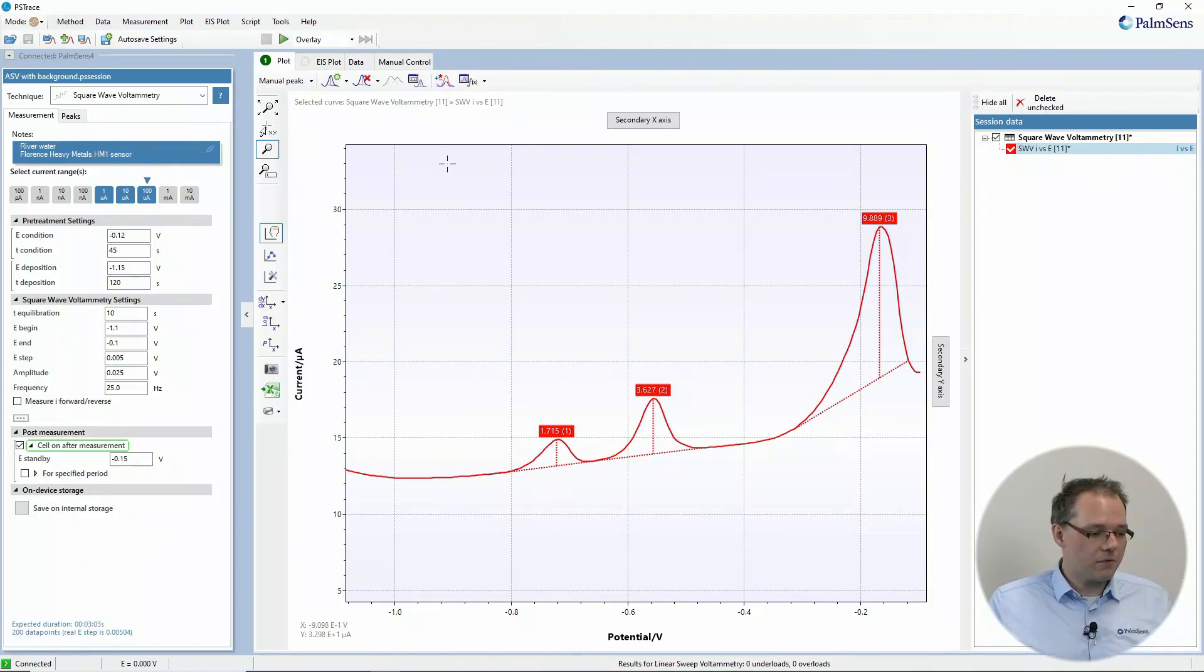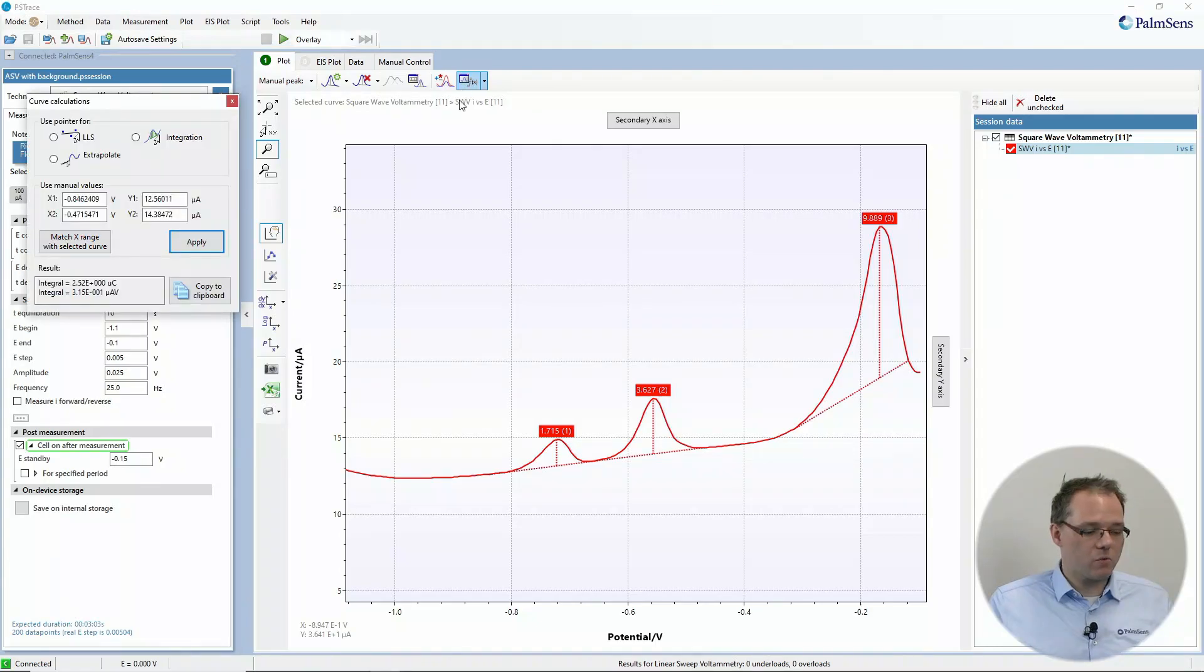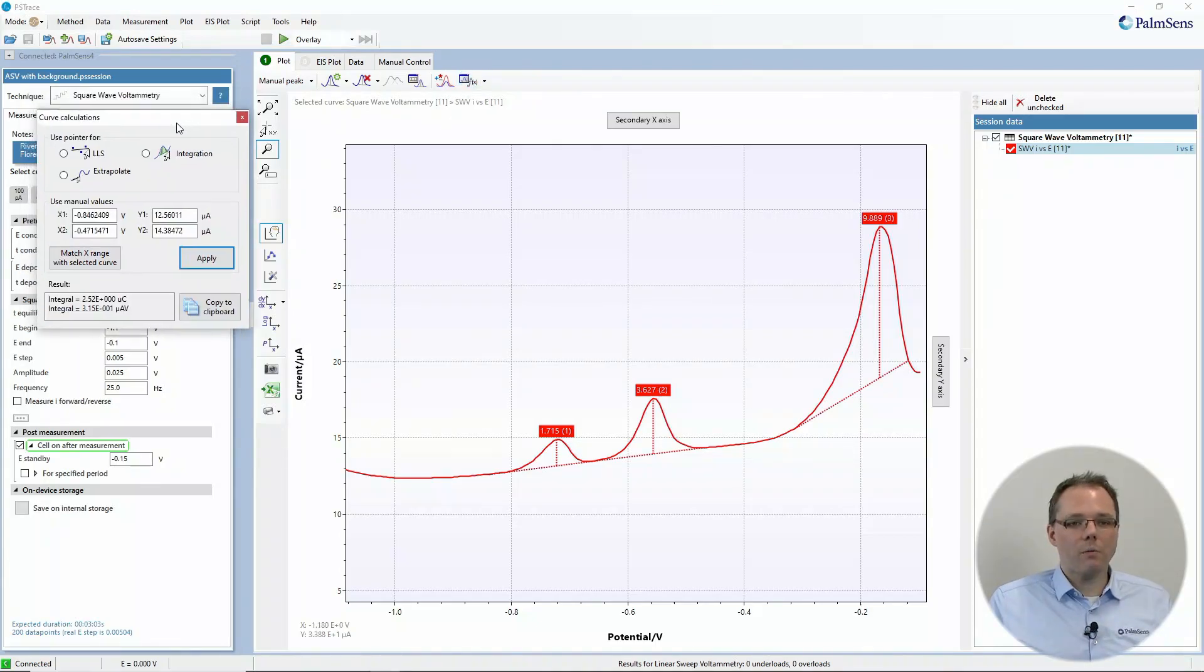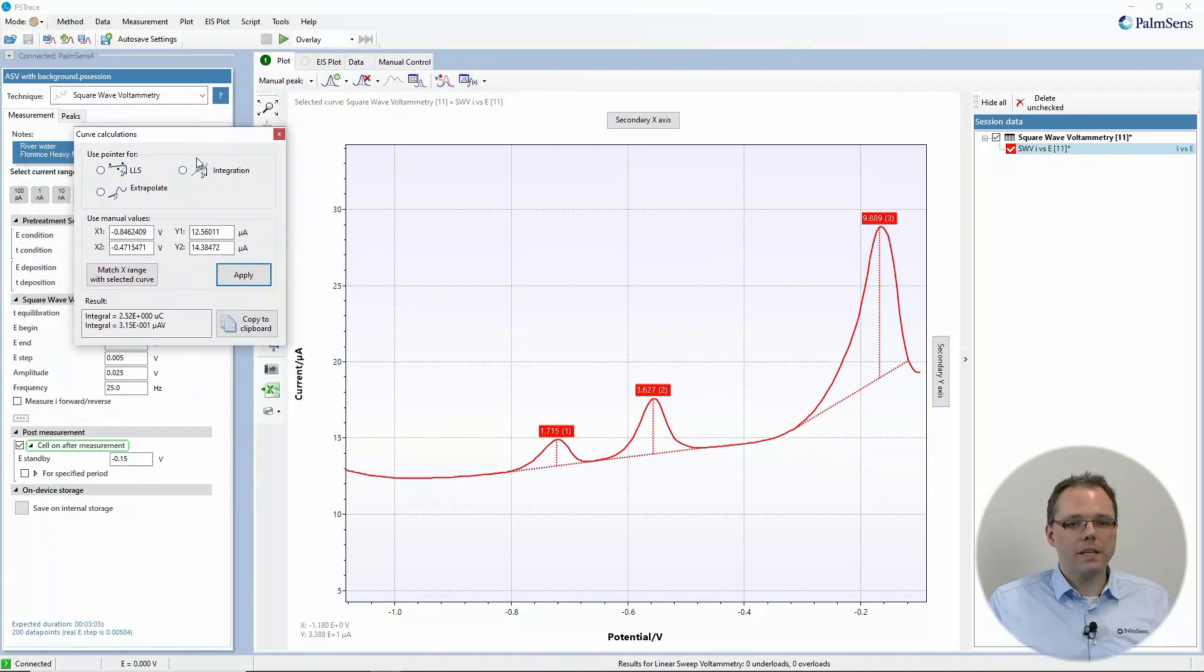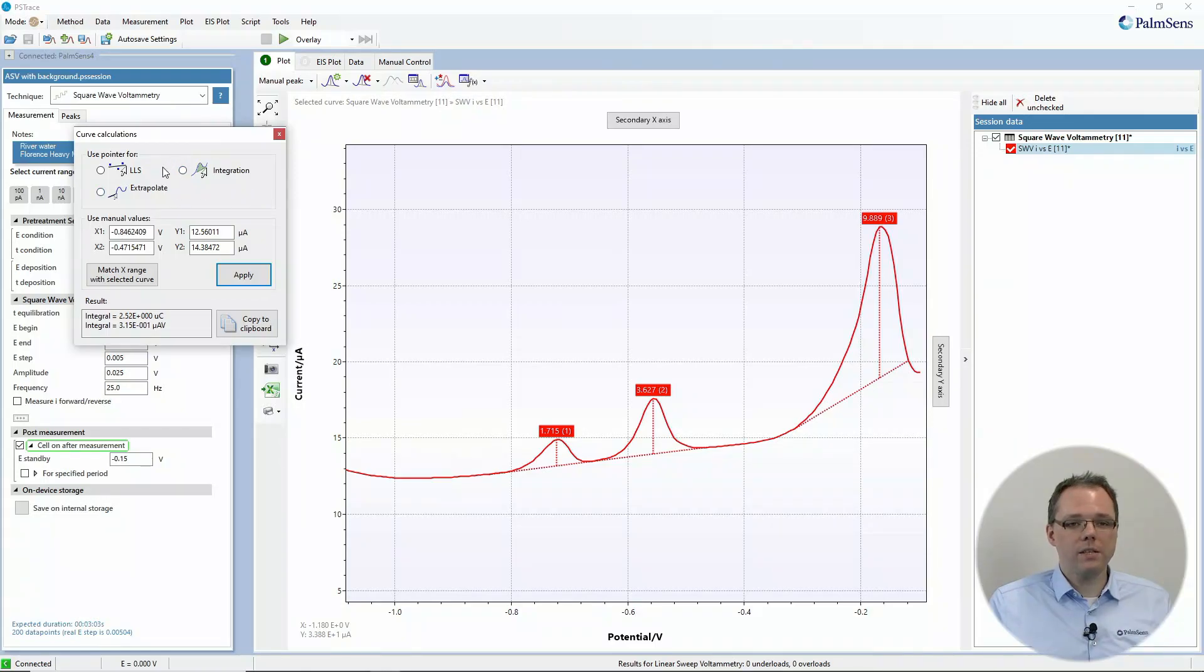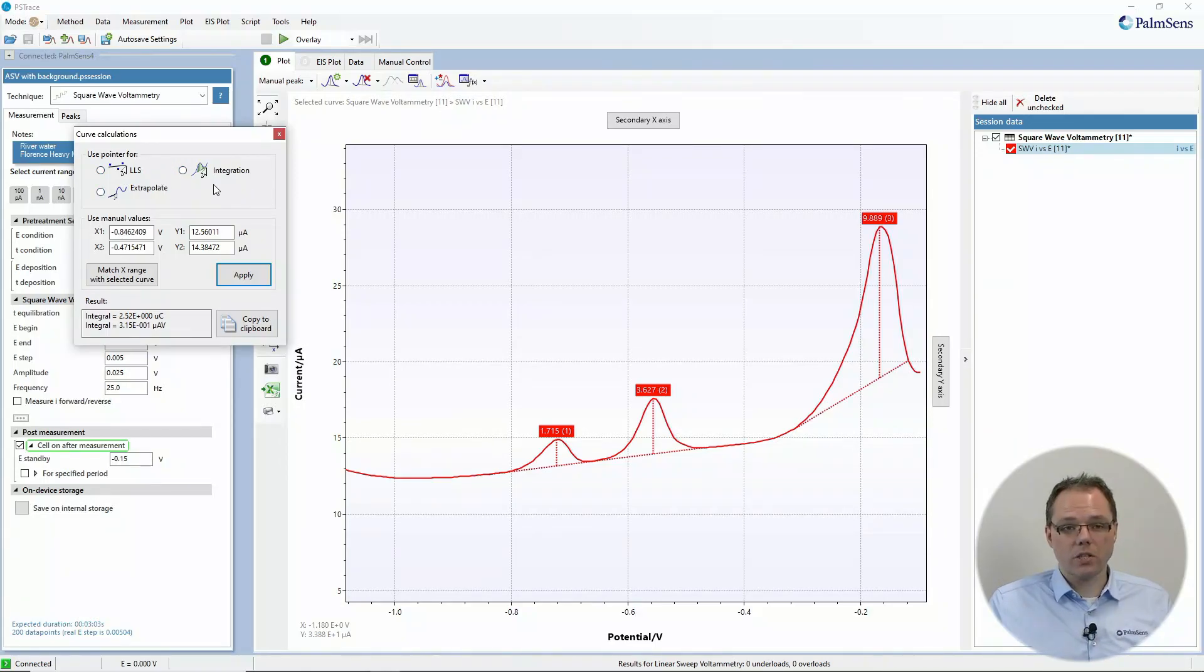An alternative to that is the curve calculations window. If you open that one, you see here different options. And today we want to focus on integration and LLS which is linear regression.